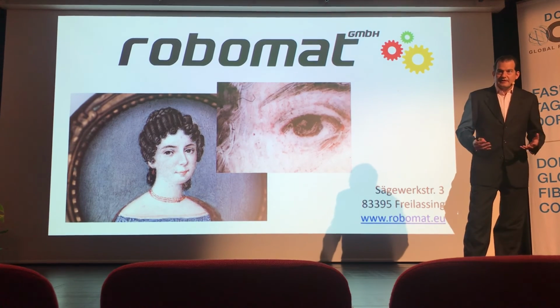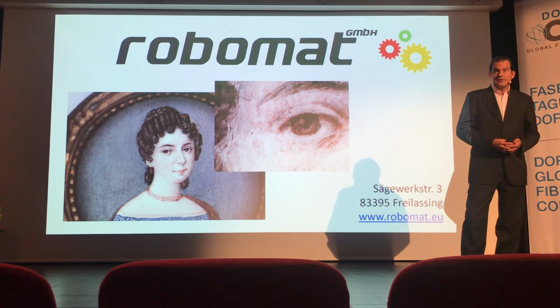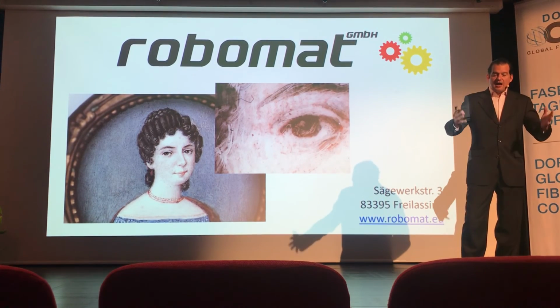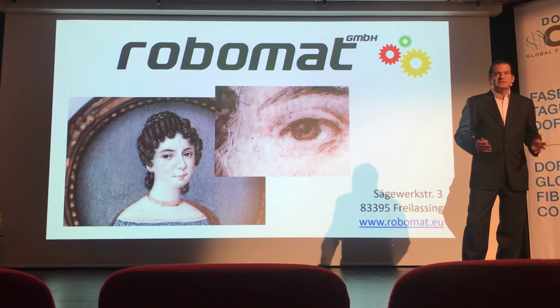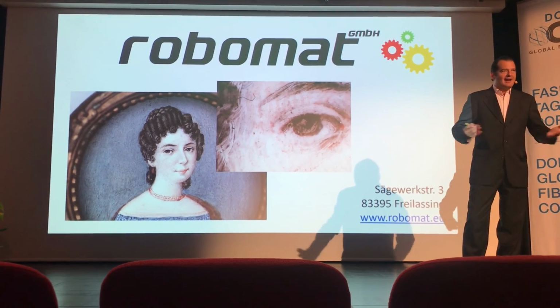Please remember that we have a very powerful image recognition and image analysis software behind it, and that if you need a large sample analyzed down to a very high resolution, then this would be a solution, and maybe in the coming days or weeks you will think about an application and then you know where to find us.